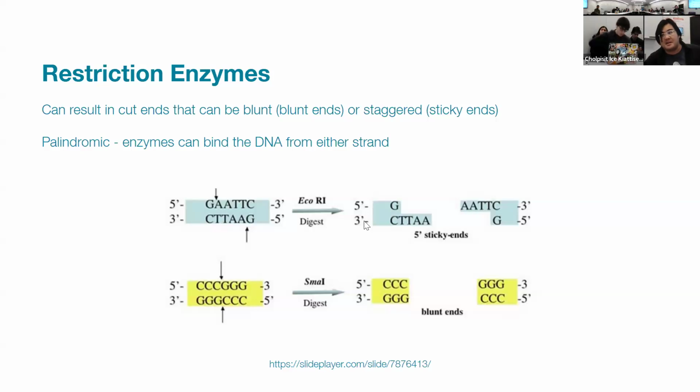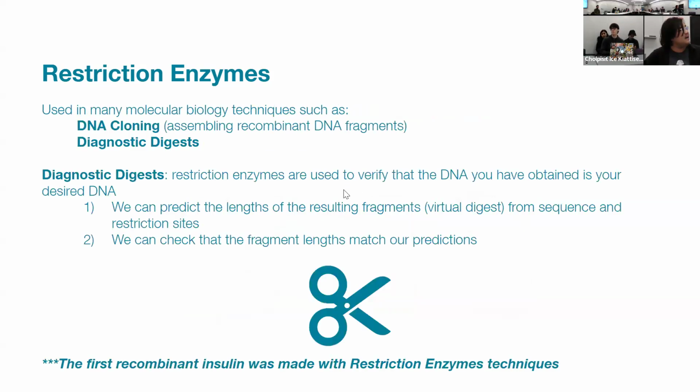If you wonder where EcoRI came from, it's from E. coli, like E. coli, enzyme 1, something like that. So in the past, that's how we got things to work. By having these enzymes, you can do what we call DNA molecular cloning. So if we have DNA and we want to move it from place to place, you can technically use these molecular cloning techniques to edit or to amplify DNA from other places and put it into the new place.